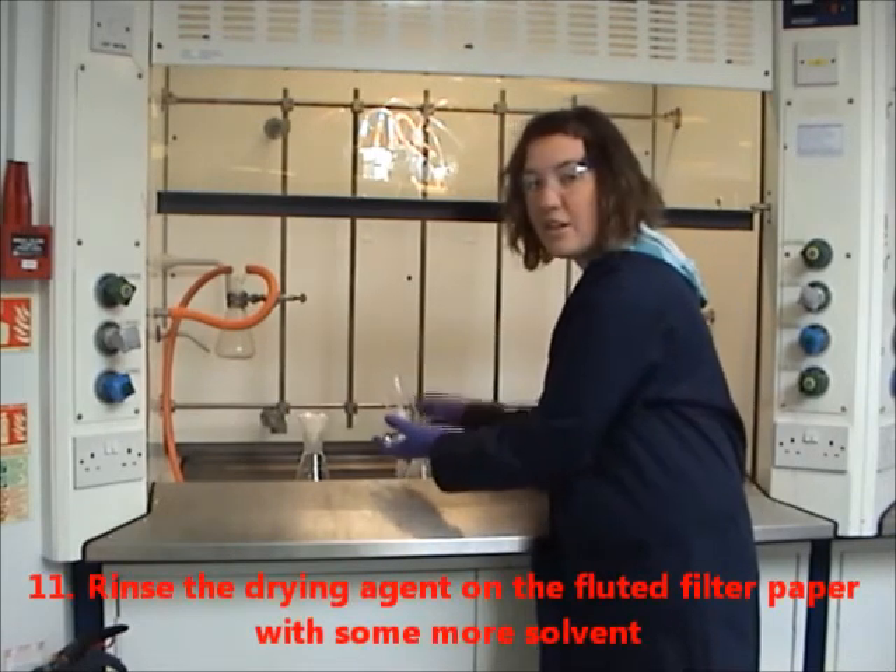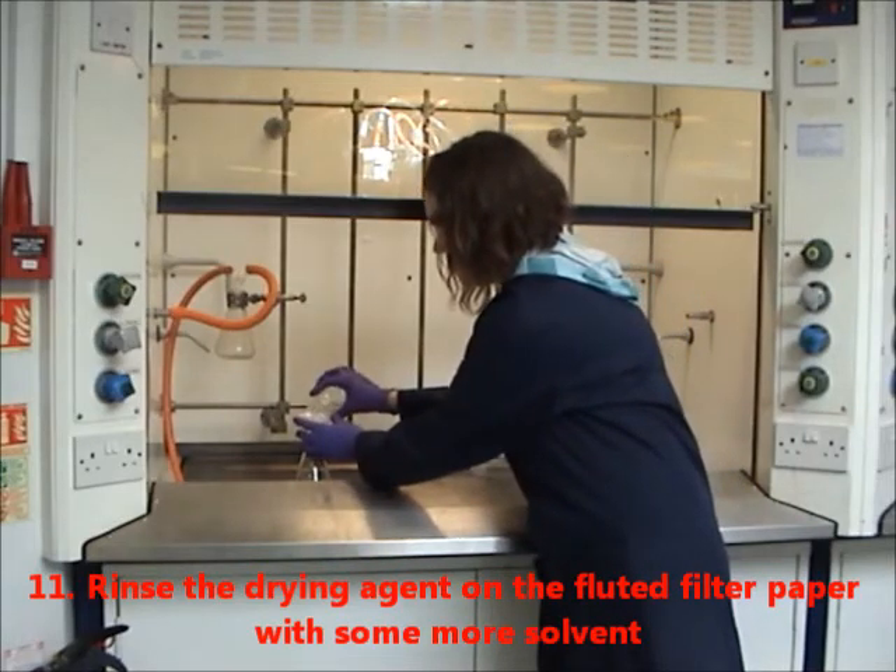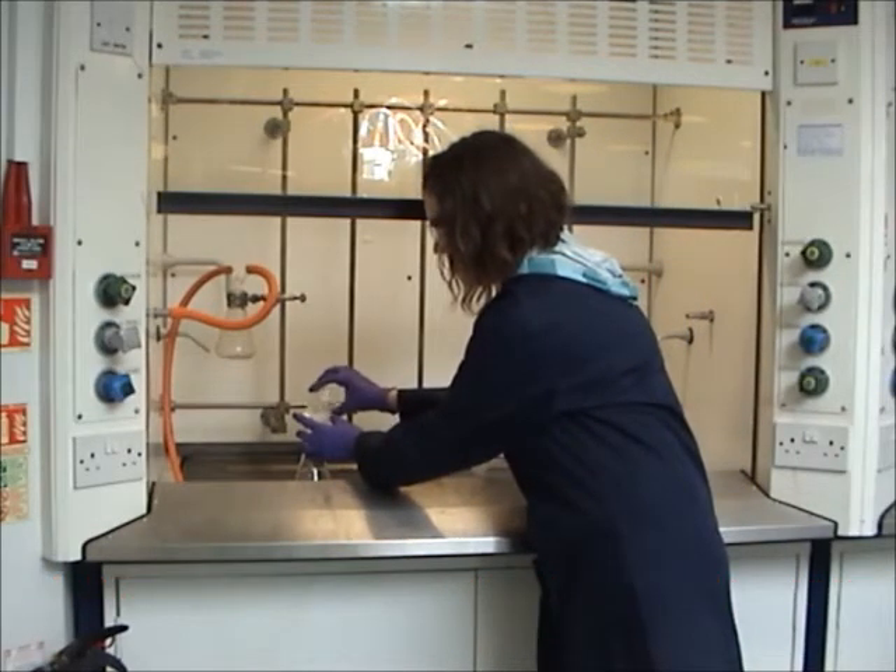Rinse the drying agent on the fluted filter paper with some more solvent. And once again, pour it through the fluted filter paper.